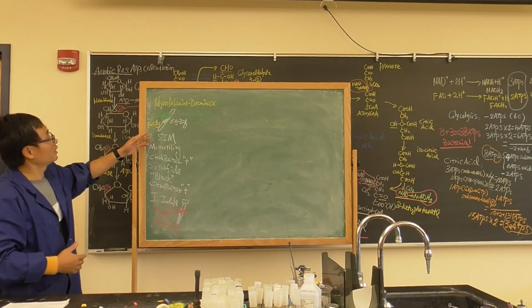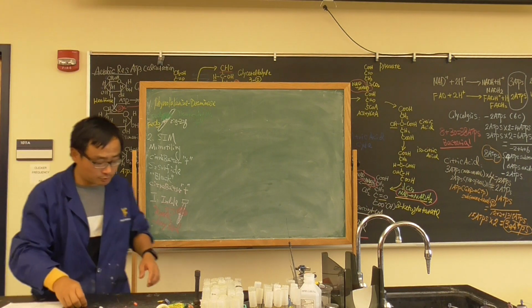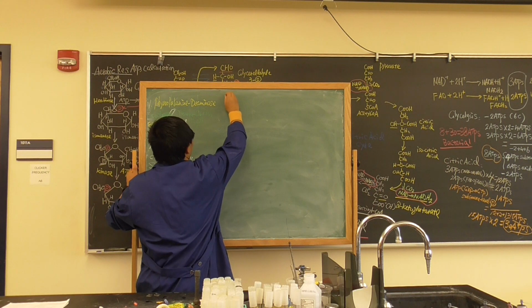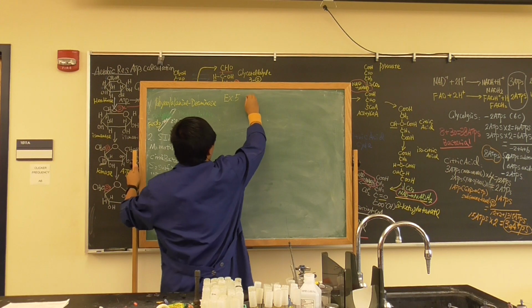Okay. Now, for the phenylalanine test, you have ferric chloride right here. Put a couple of drops and then shake it. You tell me which one is positive. Okay, what else are we going to do today? We're going to do exercises, I remember it's going to be number 5 maybe. Okay, oxidase test.